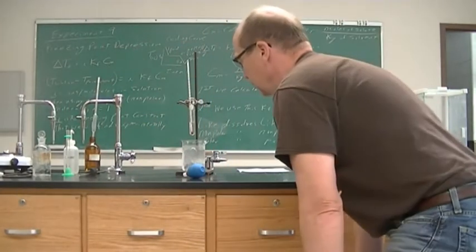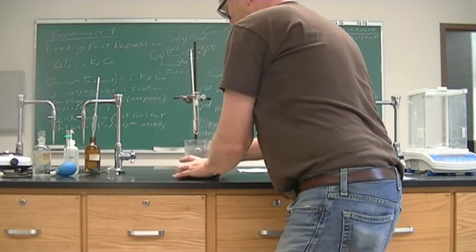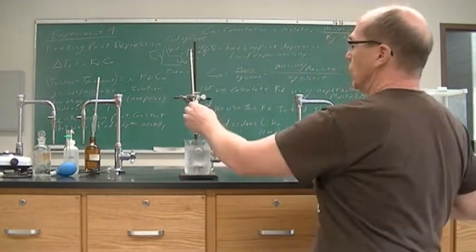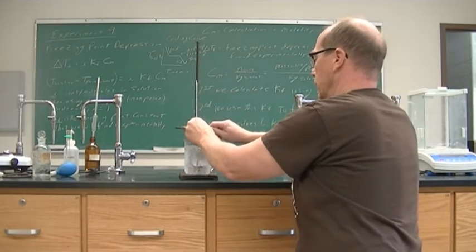And in the directions, it says to give the temperature every 15 seconds once the temperature gets down to 15 degrees Celsius.